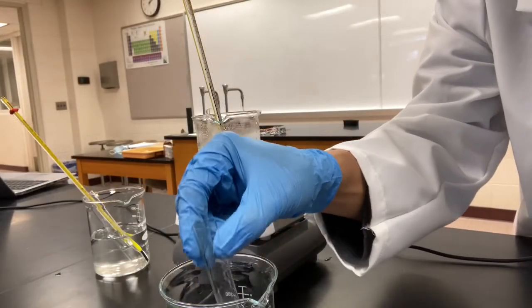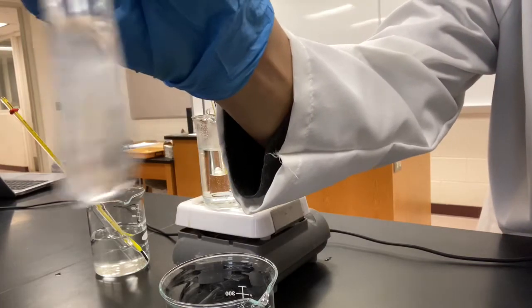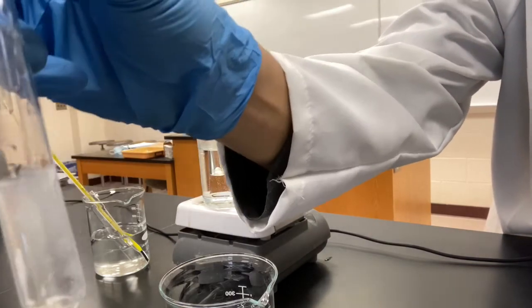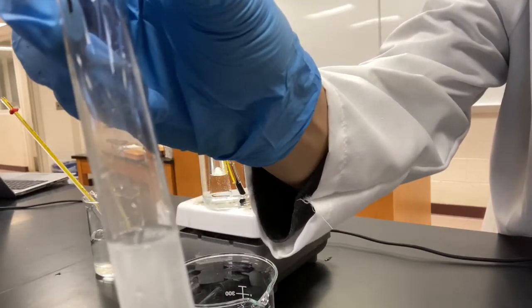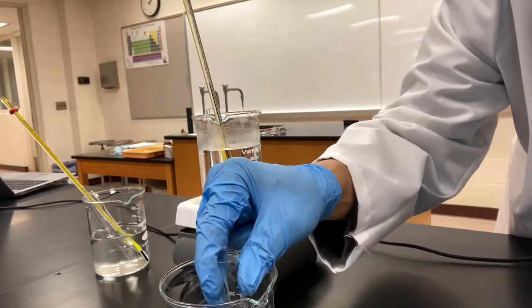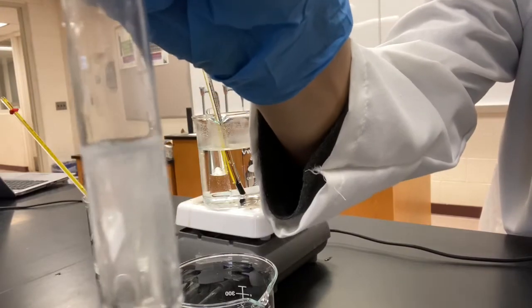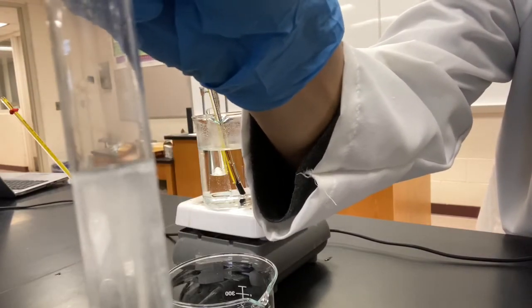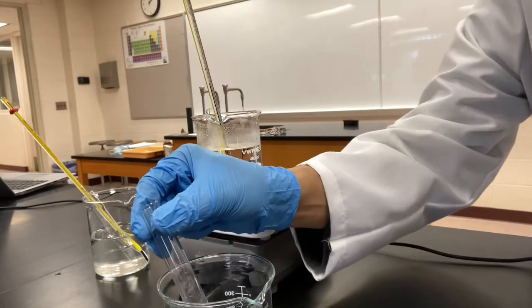It has been 8 minutes 30 seconds. It's still there, still reacting. Little small piece of zinc on the top. Okay, still there. Don't know if you can see it. It is still there on the top. Oh, it's broken down.